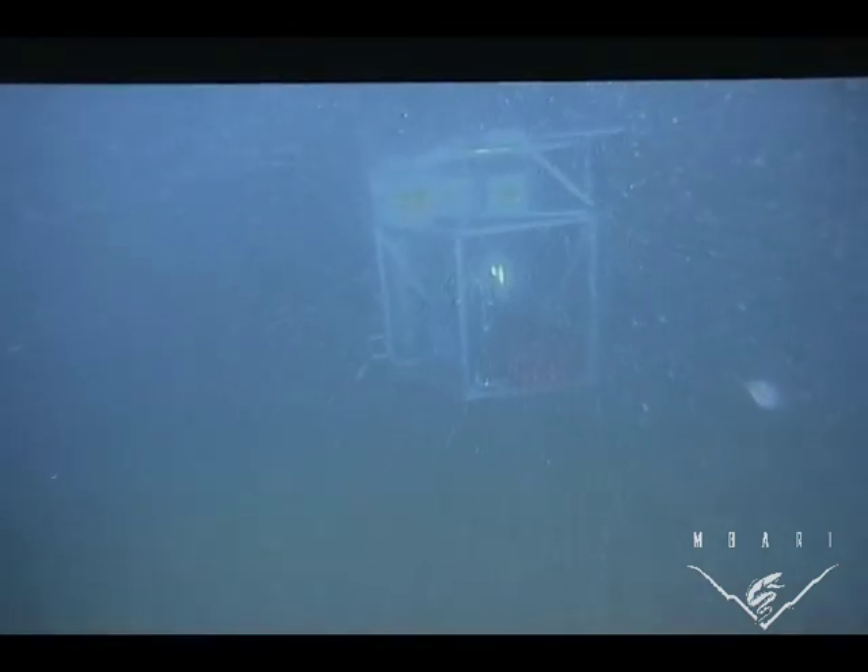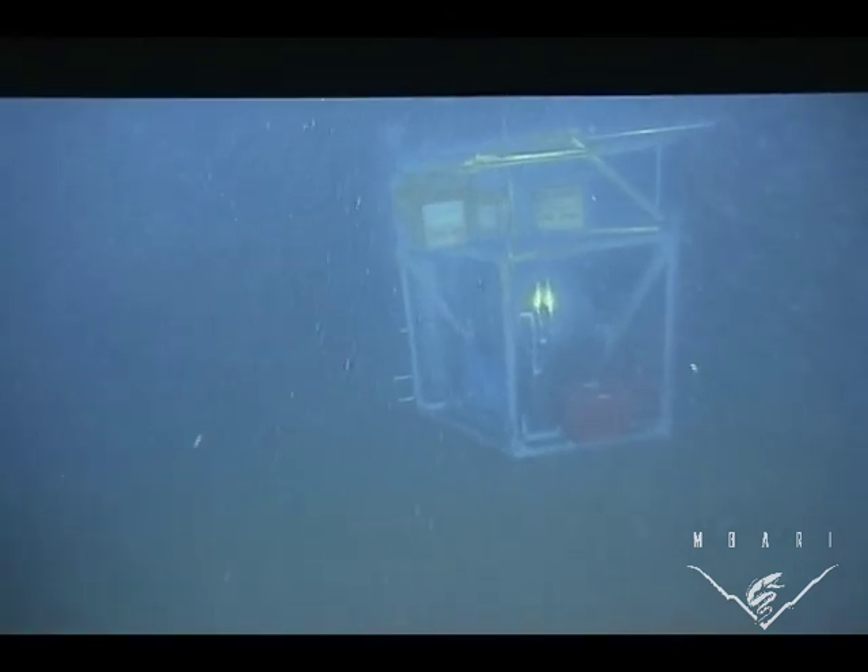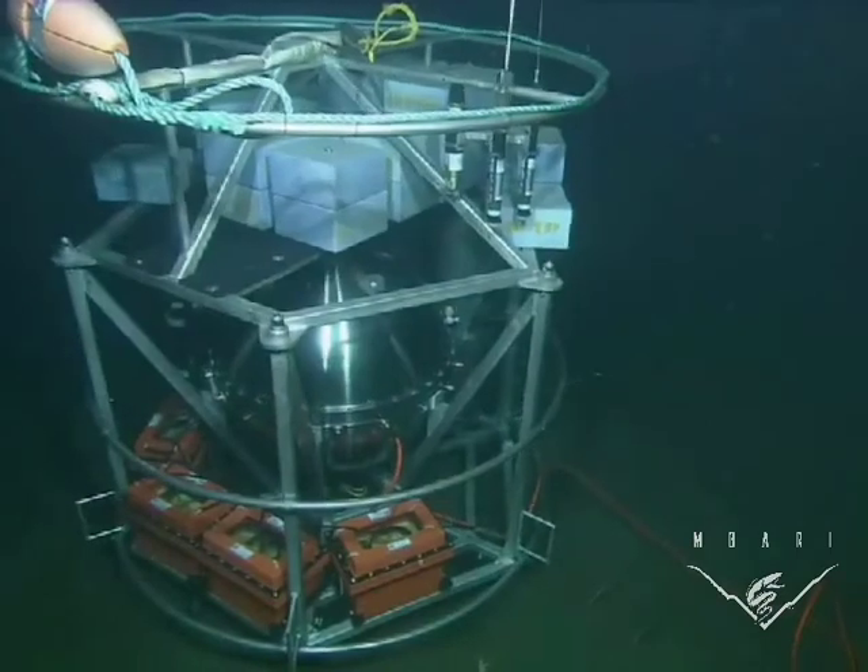Here we are looking at a screen in the control room. This is off the video of the remotely operated vehicle that flew down there to make sure that the ESP is sitting correctly, and we see that it landed very nicely.